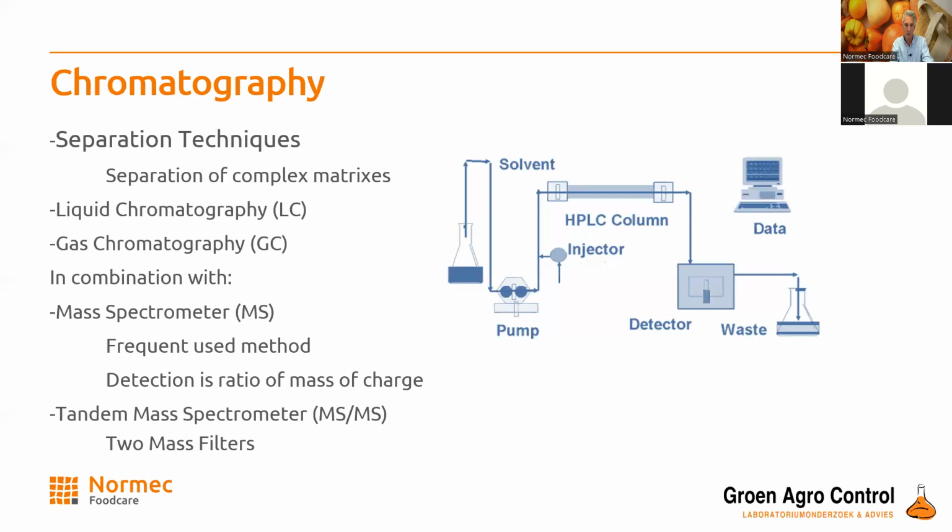You see also how it works. It's a really old picture, more based on the HPLC method, but in principle it's the same now with the new equipment. It's really expensive equipment. Normally for an LC we pay about 200,000 to 250,000 euro for each machine. Yeah, that's a lot of money. And even before we can use one of these machines, we have to validate for more than 6 months to be sure that the new equipment has the same results as the ones we already used before.